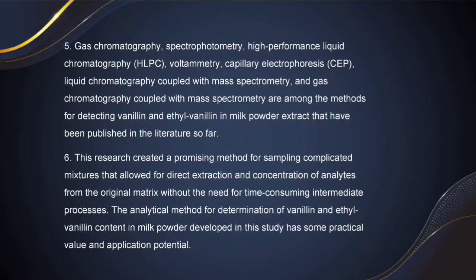This researcher created a promising method for sampling complicated mixtures that allows for direct extraction and concentration of analytes from the original matrix without the need for time-consuming intermediate processes. The analytical method for determination of vanillin and ethyl vanillin content in milk powder developed in this study has some practical value and application potential.